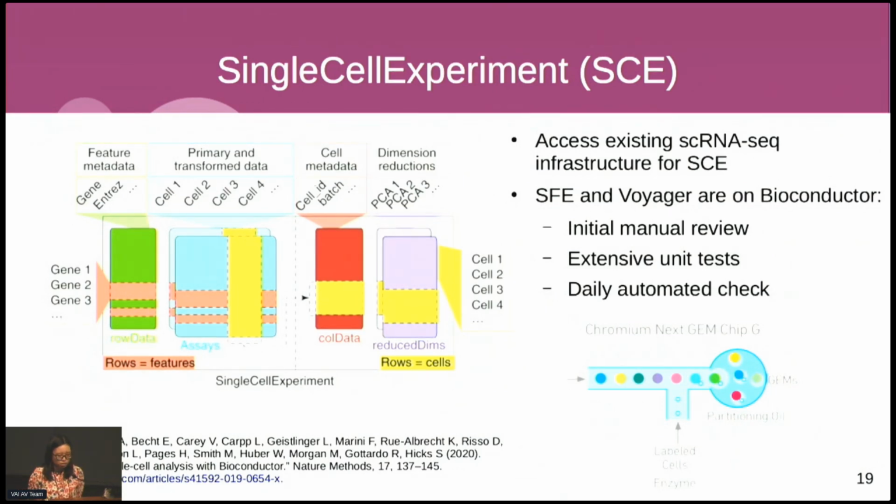It centers on a gene count matrix with genes in rows and cells in columns, and we can have metadata associated with the genes and the cells, and the projection of each cell into a lower dimensional space. Because we're here for spatial transcriptomics, we're focusing on gene expression.